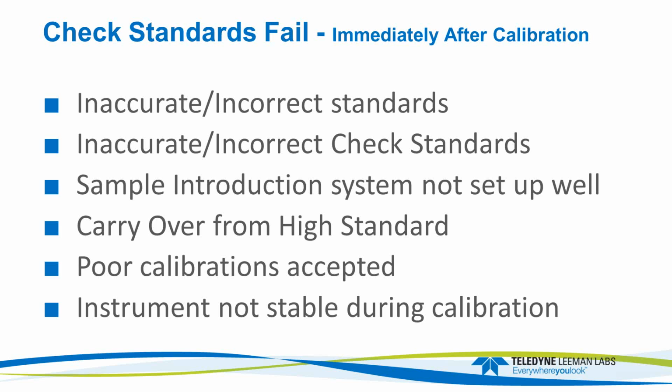Right? Sample introduction system's not set up pretty well. I got through the calibration, but now things have drifted a little bit right off the bat. Let's take a look at that. Carryover from the high standard, I've seen that where the high standard is not washed out. We do a reading on the check standard, and it fails because I'm getting some contribution from that standard.